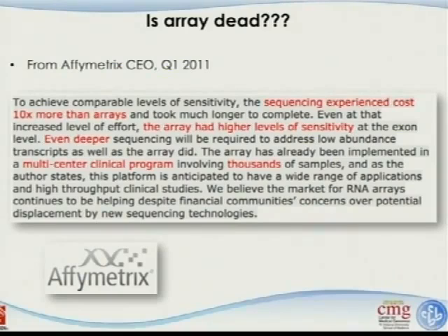And this part is trying to compare the RNA sequencing with microarrays. There are certain applications, but it's still on the research part of it, trying to target low abundant transcripts. So people design the chips to target these very low abundant genes, and then they hybridize on that and only focus on that part to do the RNA sequencing. There are certain specific applications on that, but it's still work in progress, and I don't think that will address the issue of RNA-seq. Okay?